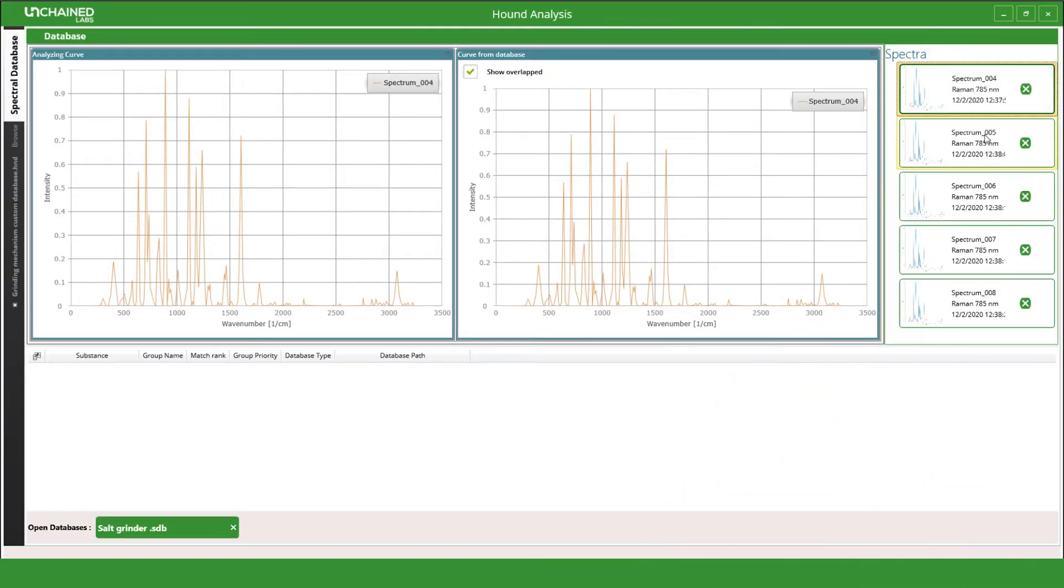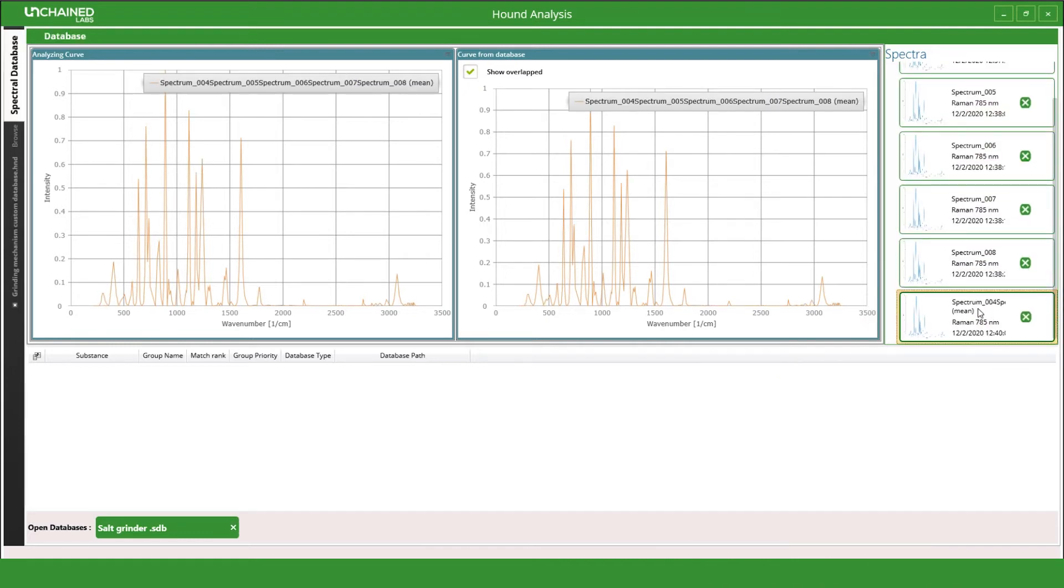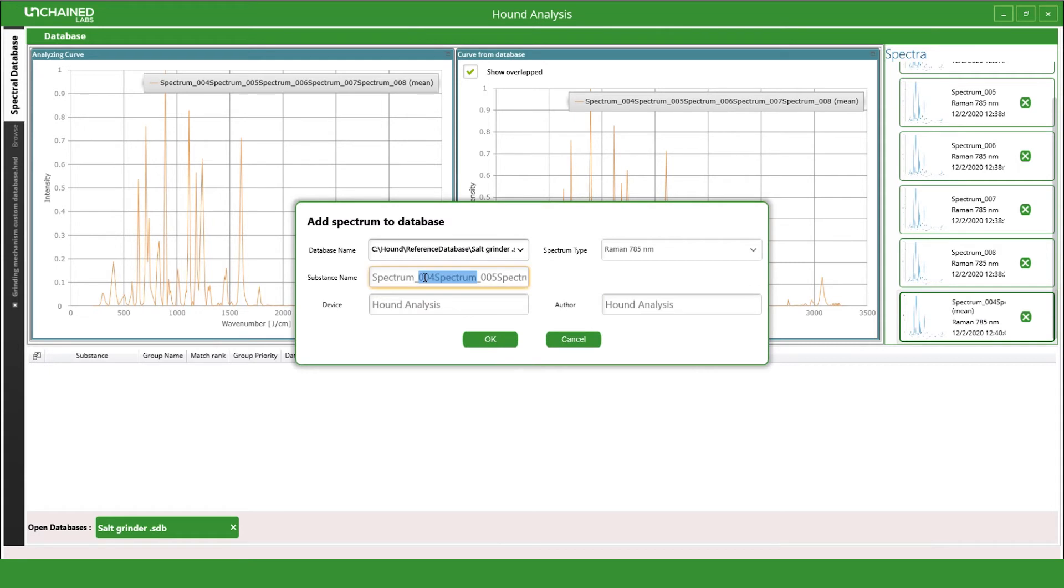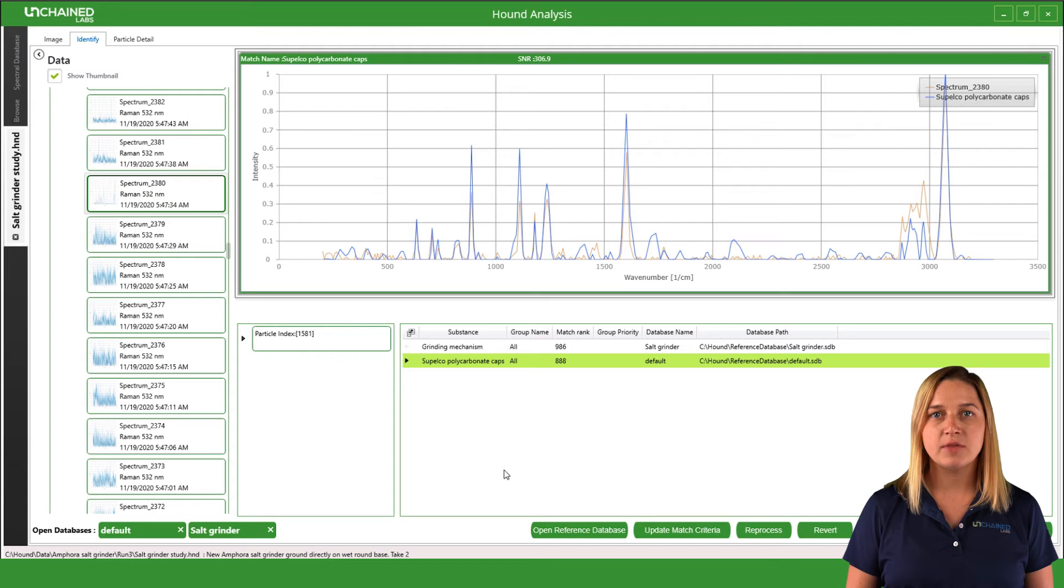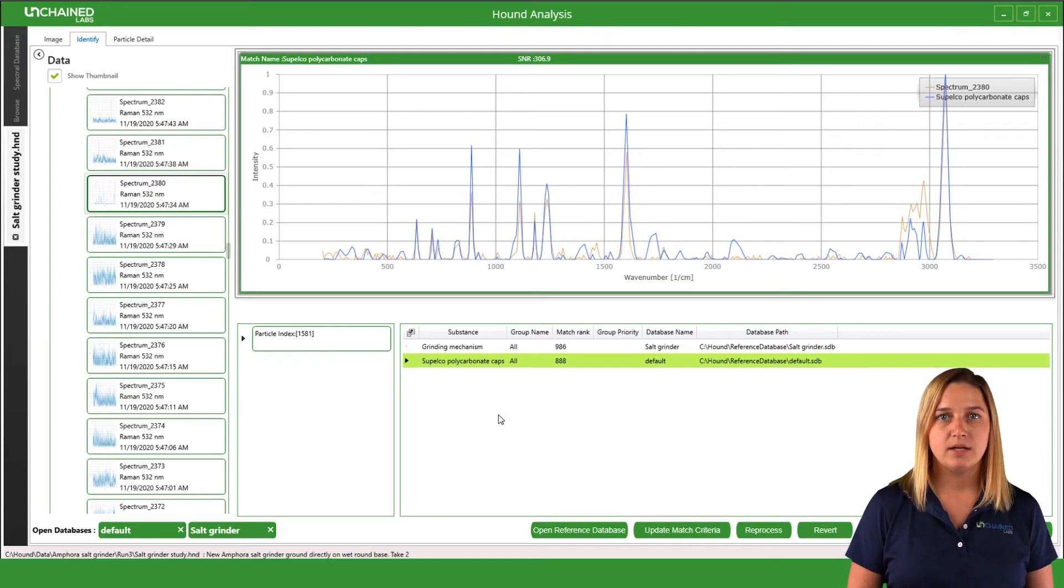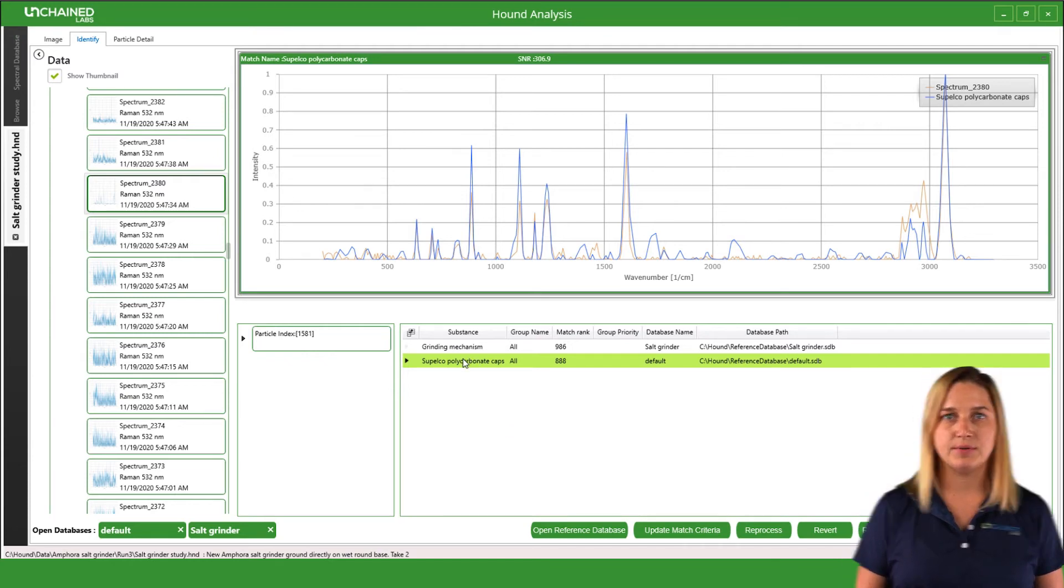Once I have all the spectra that I need, I'll switch over to the Hound analysis software, calculate an average spectrum, and add it to our new custom database. About half a percent of the particles were polycarbonate. Here is one of those plastic particles as an example.